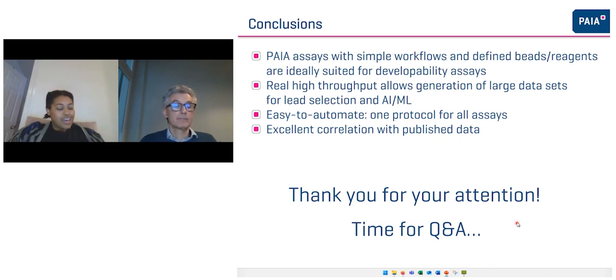G. Ring. So the first question is, is the shelf life of 6 months for unopened, unsealed plates, or after opening? Yeah, excellent question. So the shelf life of 6 months is for the unopened, but after opening, it's good for another 3 months.